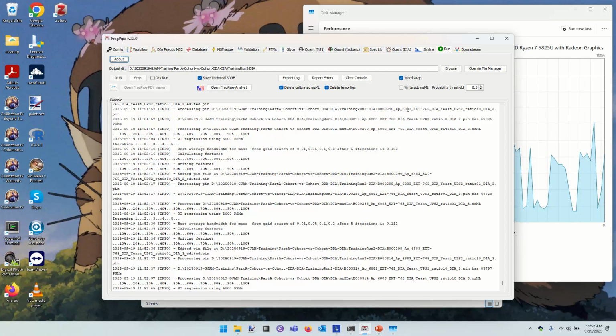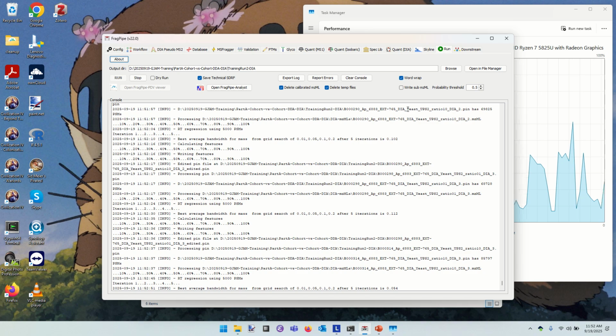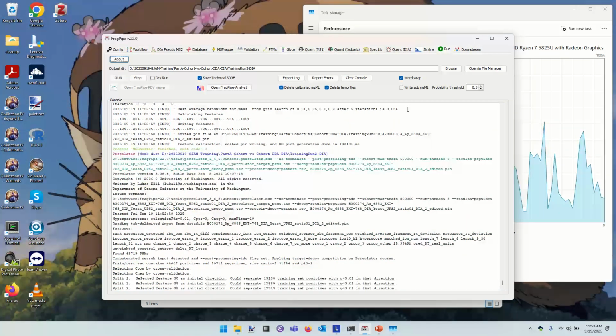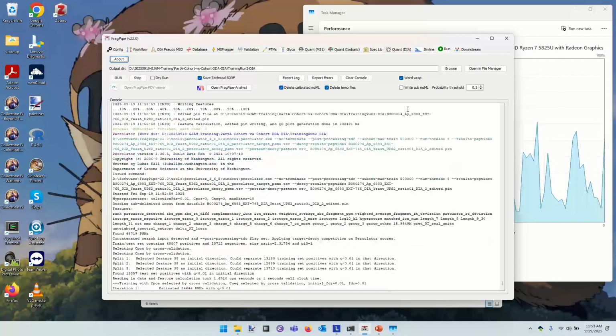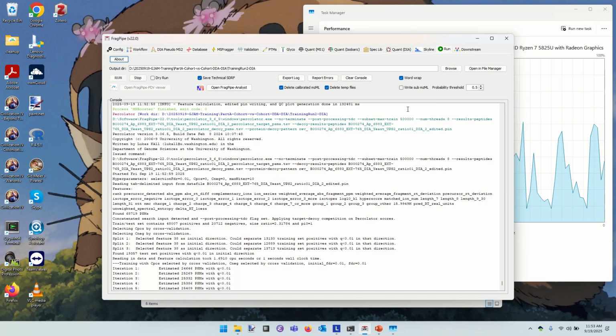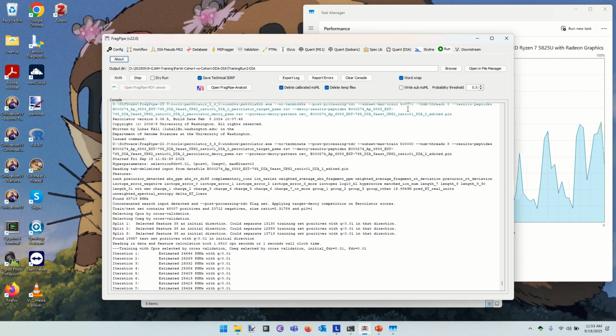So why would we go about changing it all up? I mean, for 2 decades, everyone in LCMS/MS was doing DDA. Why would DIA suddenly eat DDA's lunch? At base, the quantity information that we used in our first experiment in the DDA analysis was built almost entirely on MS1 data.